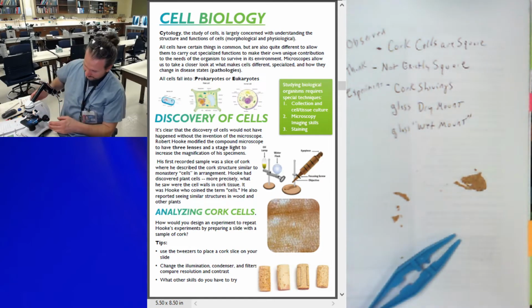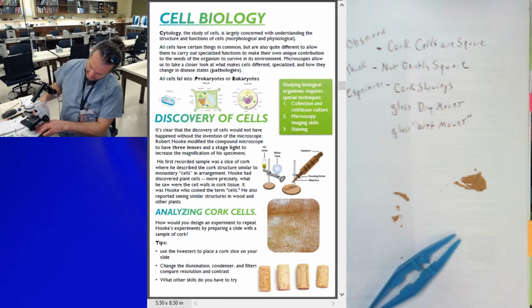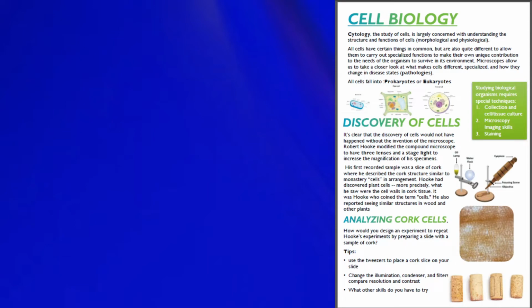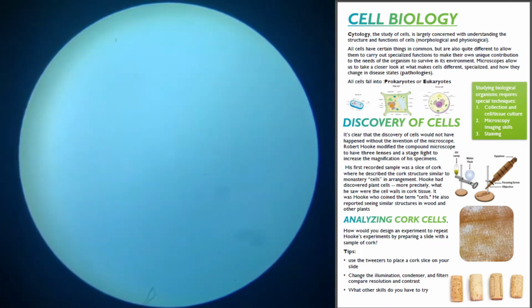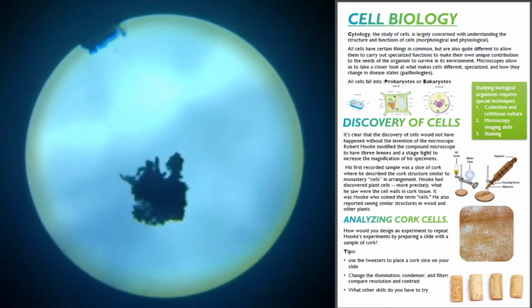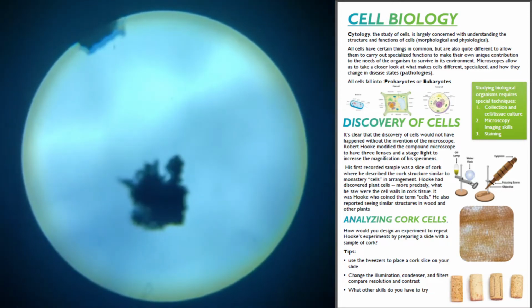Centered in the middle of the diaphragm. Iris. I have my overhead on, which is beautiful about your scope. So I flip the overhead on, and let's see what it looks like. Down, so I'm going to bring it on up. Oh yeah. Oh no. Autofocus is on. Okay, a problem I've already bumped into. Got a lot of light there.